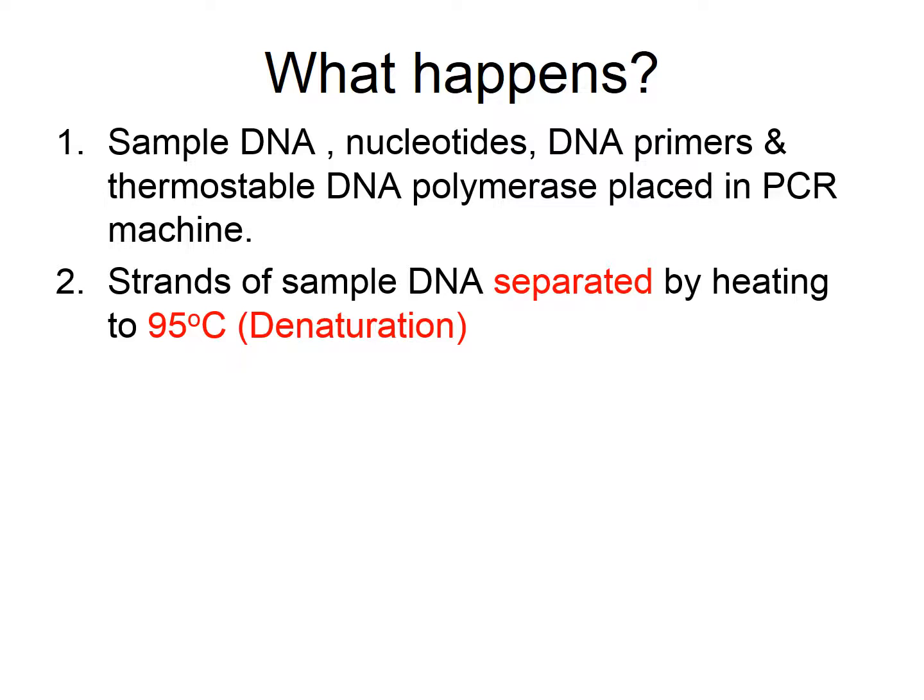So we begin with the first step, separation of the DNA. Separation of DNA in this PCR technique is done by heating. Just by mere heating, the hydrogen bonds holding the A's and T's and G's and C's are broken down. How much do you heat? You take the temperature up to exactly 95 degrees centigrade. This allows the double-stranded DNA to separate out.